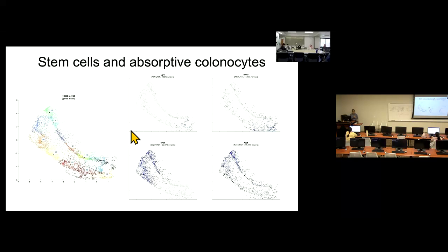Nowadays, we try to make the whole procedure fully automatic. But indeed, we do need to have a better understanding of the system you're working on. In this case, Michael is familiar with the system. He knows what kind of cell type, subtype of cells he expects to see, and with markers, he's familiar with those markers. It's really hard to replace human annotation with this automatic procedure.